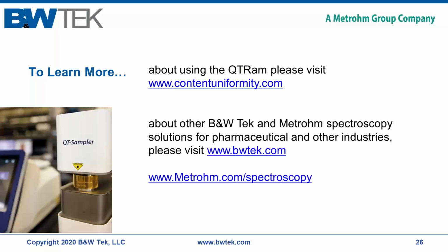Great. Our next question that we had in, have you ever measured complex active compounds such as botanical extracts in food matrices? We have measured them for raw material testing. So we have done that using our Nanoram 1064 for incoming raw material. We have not had occasion to do that in food matrices to quantify it with our QT-RAM. But we know that they are Raman active, and they could be measured through Raman spectroscopy, yes.